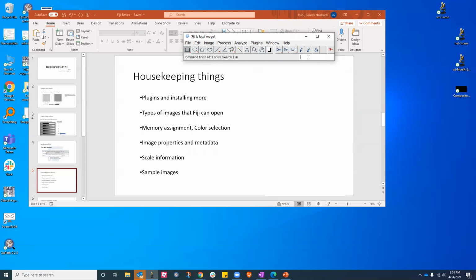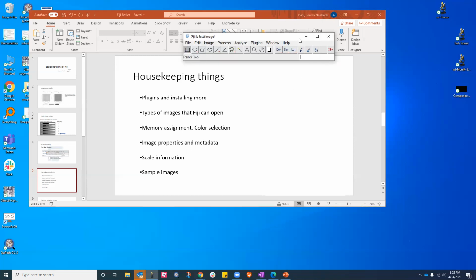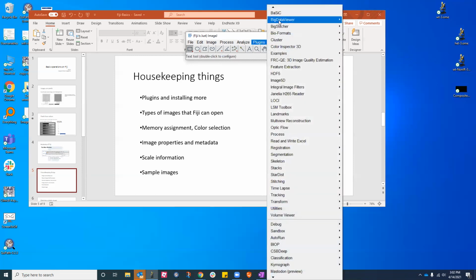You will see your cursor blinking if I press L. All right. So there are a lot of shortcuts which I will keep on telling you, which are very helpful. After a while, it's really annoying to click on something and then do this, versus just saying what I want to do. The other command which is very helpful, let's stick to this instead of going random.